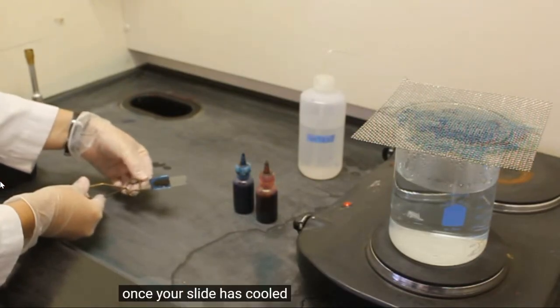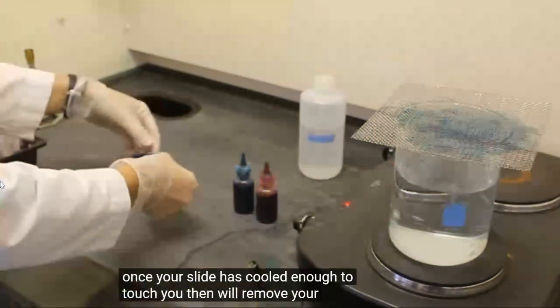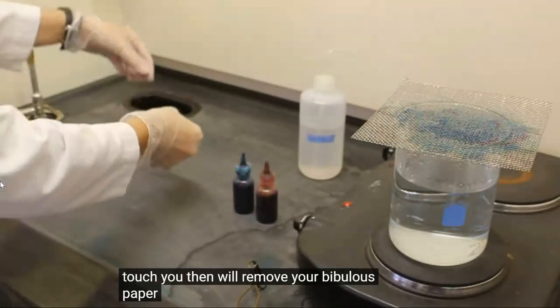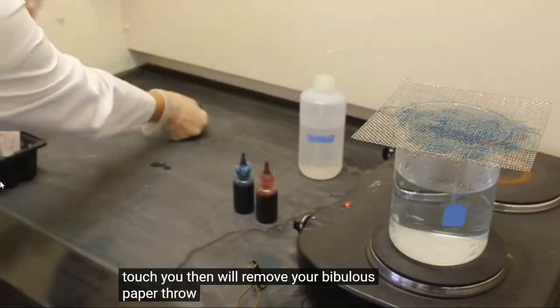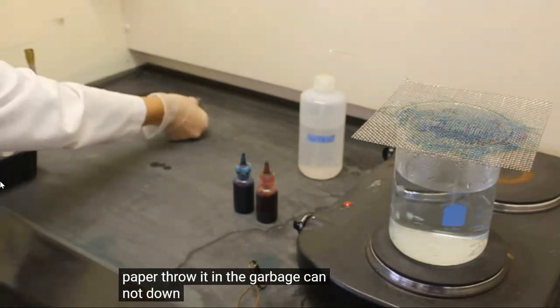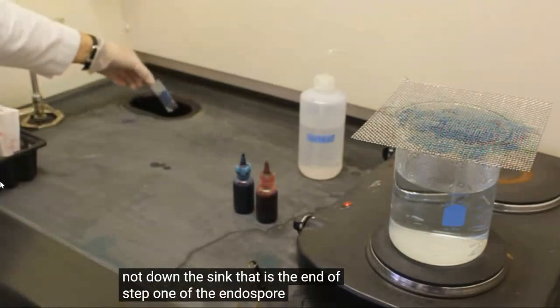Once your slide has cooled enough to touch, you then will remove your bibulous paper, throw it in the garbage bin, not down the sink. That is the end of step 1 of the endospore stain.